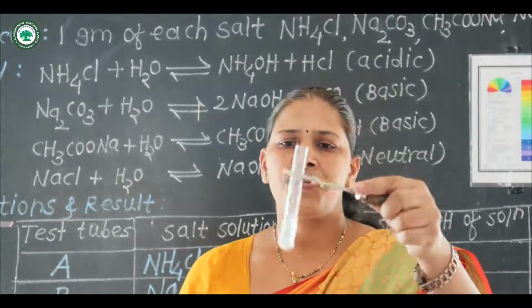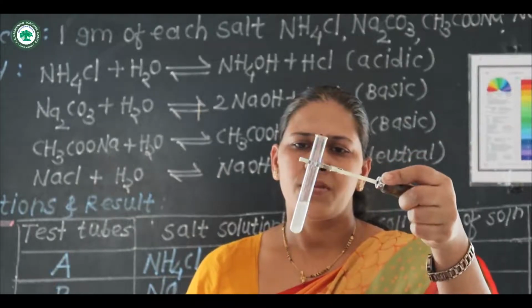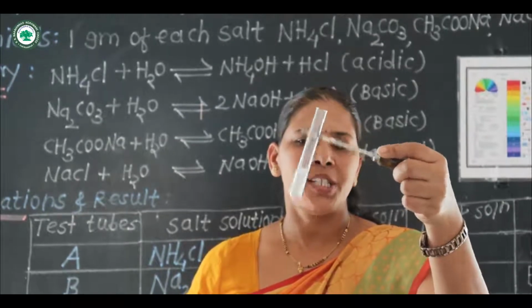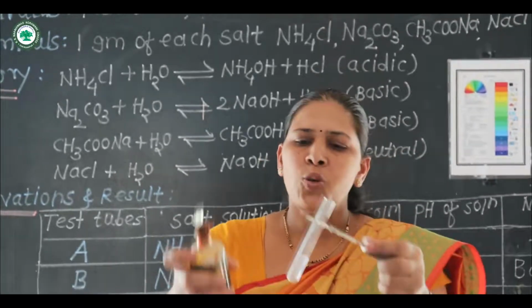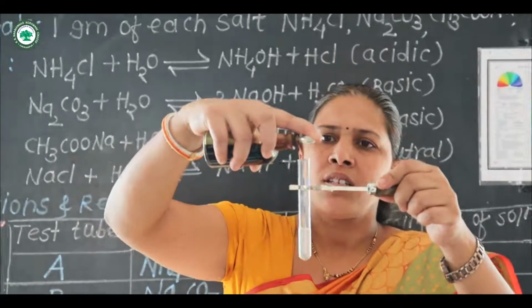Stir the solution. The salt is completely soluble in water. Then add 1 to 2 drops of universal indicator and observe the color of the salt solution.